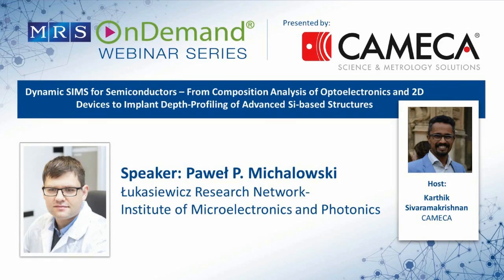I would say that this graphite emulated the graphene layer quite nicely. But obviously, this can still be affected by the matrix effect. So the precision of the contaminant levels that I was discussing during the presentation may not be as good as in other materials like silicon or silicon carbide that I showed earlier.